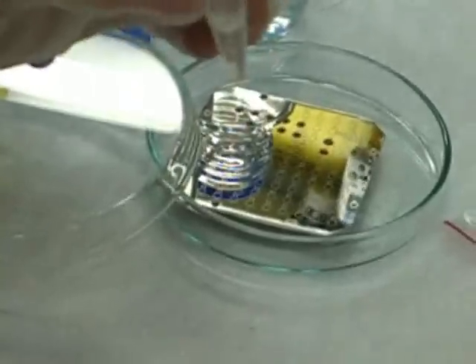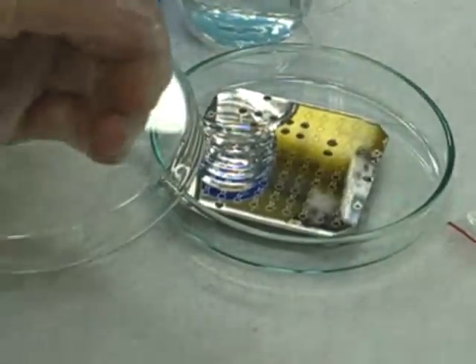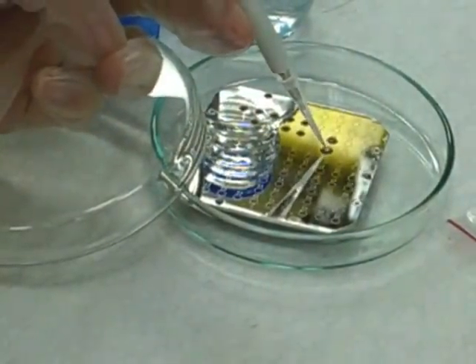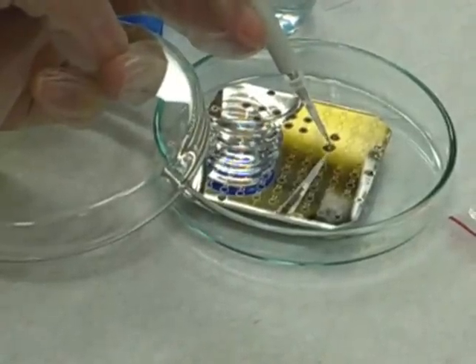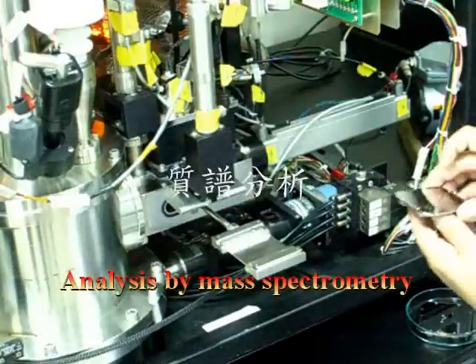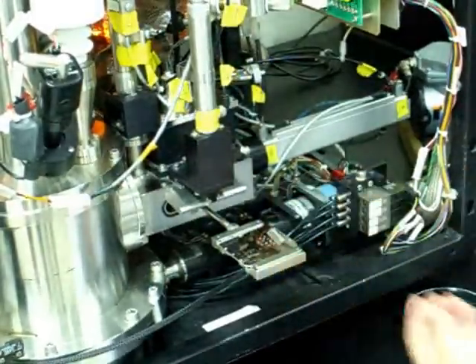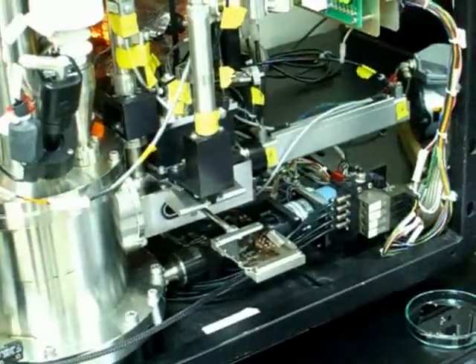Besides the target samples, the MALDI matrix should also be carefully deposited on the MALDI plate to reduce background interference. Then, send the prepared MALDI plate to the MALDI mass spectrometer. This indicates the MS signals. Amplify and analyze the signals.